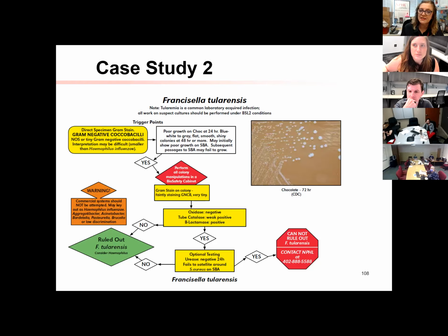So these more fastidious organisms do grow well on chocolate, but should not grow on blood plate. But sometimes, because of other circumstances, you might see a little growth too. And I just don't think Haemophilus influenzae does that.